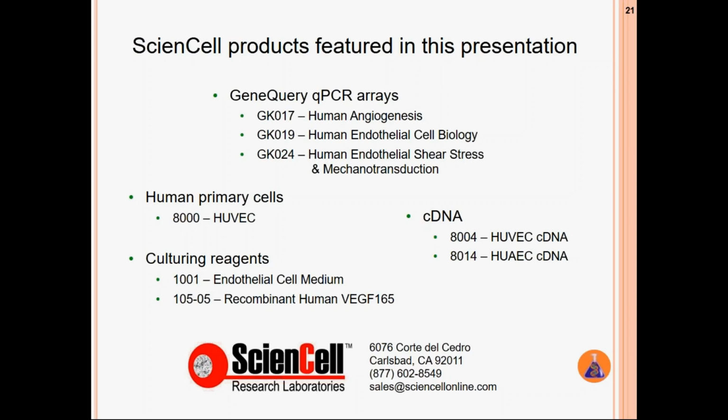Okay, what differentiates GeneQuery from other qPCR products? Well, compared to other companies' similar products, in addition to biological pathways and disease-related kits, we also offer kits focusing on human primary cell biology. I believe most of our audience here work with human primary cells. And other than that, our customized kits can better fit your needs. And for a limited time, there will be no extra charge for customization.